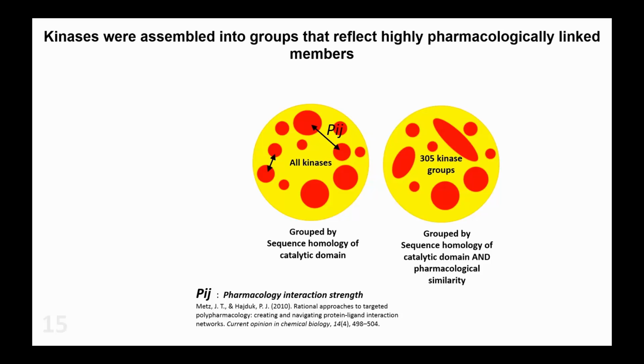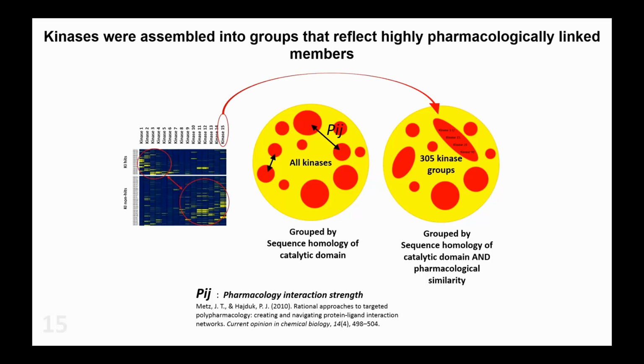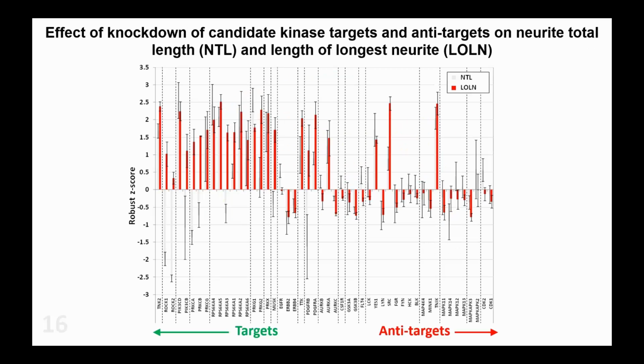So in order to test the actual biological relevance of our predicted targets, we needed to assess the contribution of each predicted kinase as well as all its linked relatives to the cellular phenotype. In this example, we would have to test kinase 15, 132, 21, and 19 to be able to make a statement about this group. For this, we used siRNA-mediated knockdown, where we knocked down kinases in the top predicted groups to see how their behavior relates to their inhibition data.